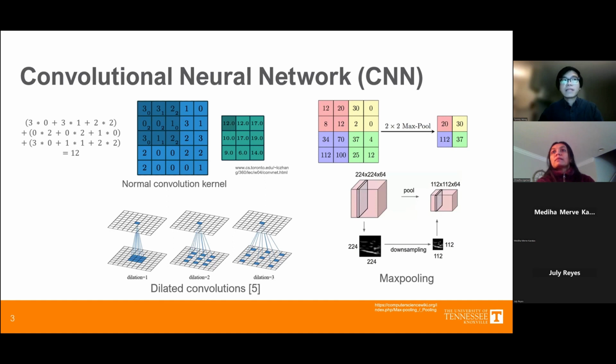So yes, this is still a classification, because you're classifying each individual pixel as opposed to the entire image. Right. For a 3x3 convolutional kernel, for one single kernel, suppose it's 3x3x1, you would have 9 neurons in the kernel, and you would slide that kernel over the entire image.